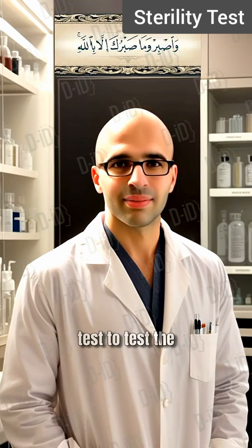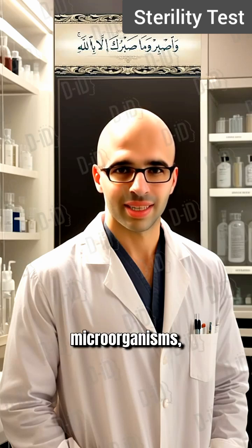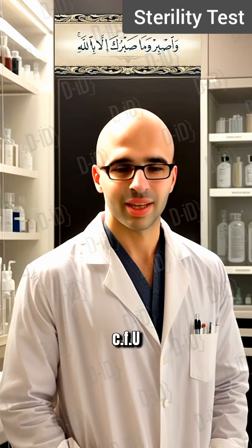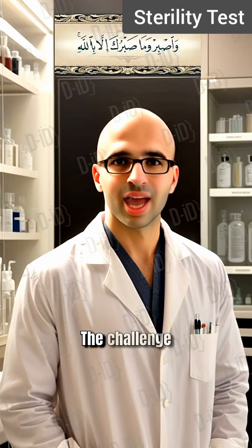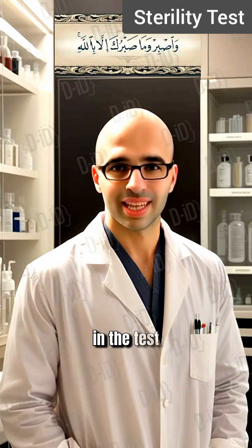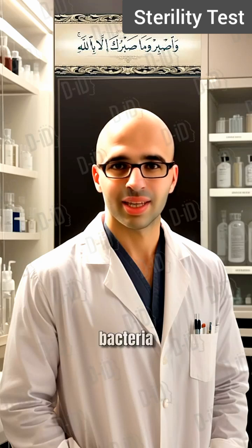Growth promotion test, to test the ability of media to support the growth of microorganisms. The media should be inoculated with less than 100 CFU of challenge organisms. The challenge inoculum should be verified by concurrent viable plate counts. Growth promotion challenge organisms should show clearly visible growth in the test media within 3 days for bacteria and 5 days for fungi.